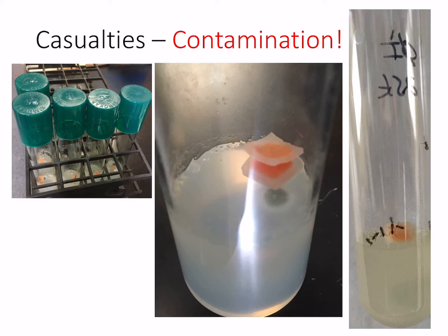That's just the way tissue culture goes — you always have to set up lots of replicates and often have to start over when something doesn't work. For this first week, we have five casualties: five culture tubes with contamination. Four of them were mold, which looks like this — you can imagine a single mold spore fell in and grew out in all directions. If we were trying to grow mold, this would be beautiful, but of course we're not.